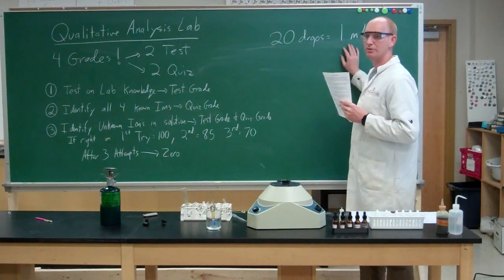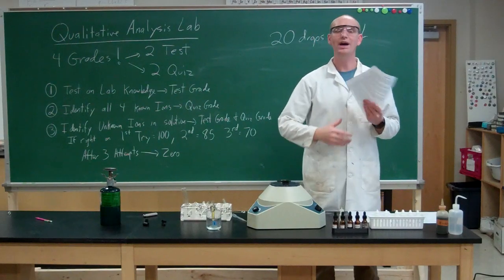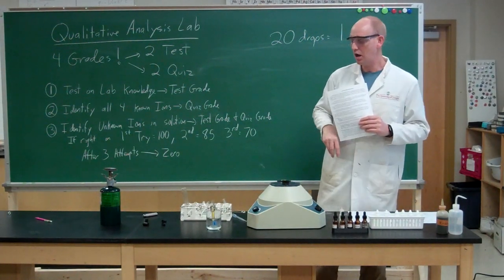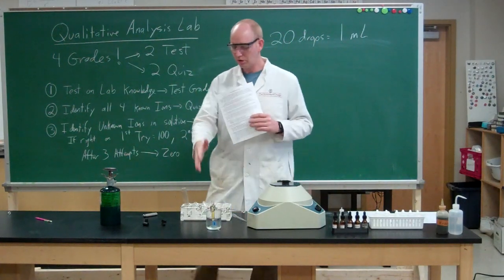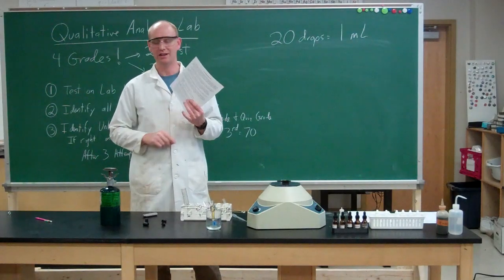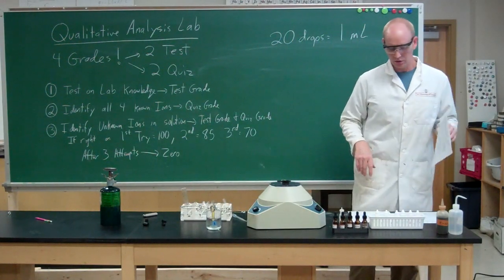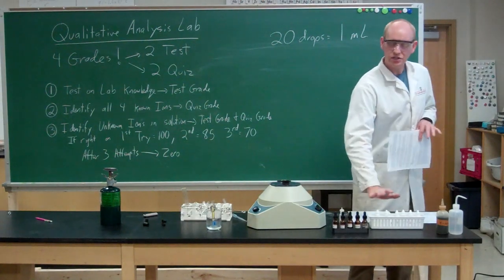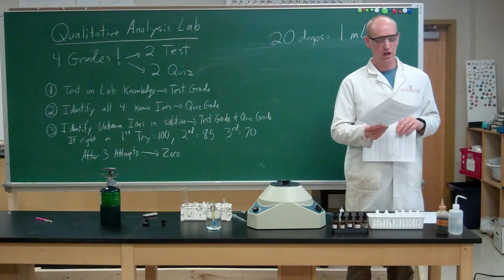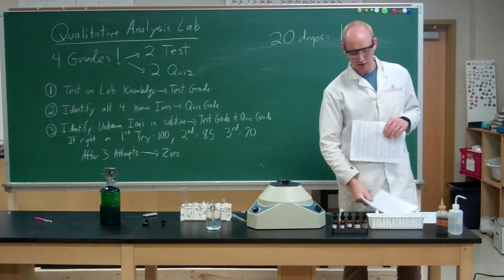You need to know how many drops is in a milliliter. You need to know how to run a centrifuge, how to balance a centrifuge. What happens if your centrifuge is going crazy and is trying to jump off the table? You need to know how to heat a hot water bath. You need to know how to heat a test tube. You shouldn't point it at anybody. Never heat a closed system. You don't really need to know what stock solutions you add at what step. That's what your procedure is for. We're not going to say, you know, what solution you add at step 14 in the lab.